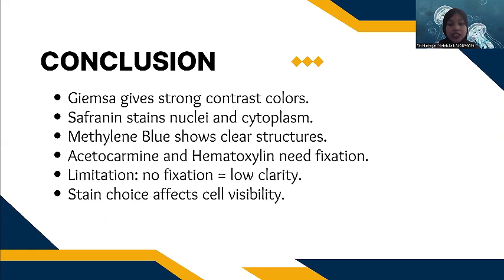The difference in effectiveness highlights how both the chemical properties of stain and sample treatment, such as fixation, must be considered for accurate observation. Through this experiment, we gained valuable insight into the microscopic analysis of protozoa and the practical significance of staining technique in laboratory diagnostics.